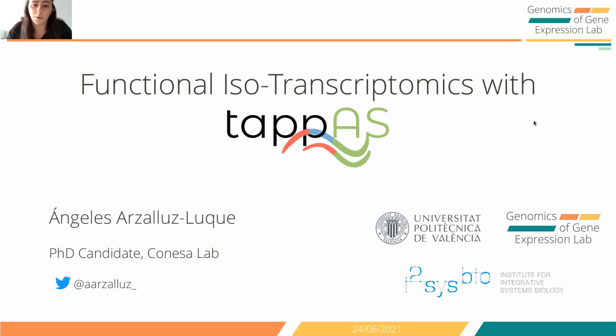And today I'm going to do part of what was originally conceived as a long-read tutorial. I'm going to cover the basics of what functional isotranscriptomics analysis with TappAS is. This is going to be a very practical presentation, very focused on how to use the application, how to get around the interface, and the possibilities of analysis using TappAS.